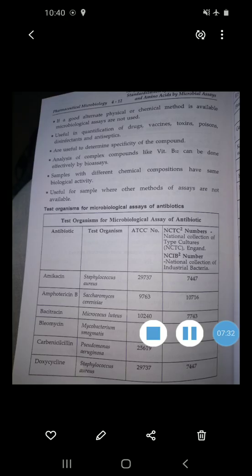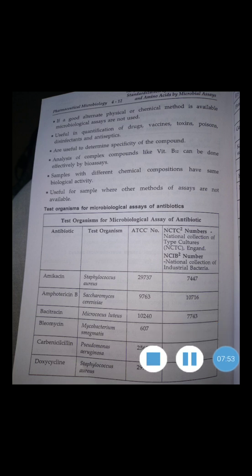Then a standard curve is plotted by using 5 different concentrations of the standard solution prepared by dilution of the stock solution. Next, a medium concentration is selected and the test sample of the antibiotic solution is adjusted by dilution to obtain approximately this concentration.